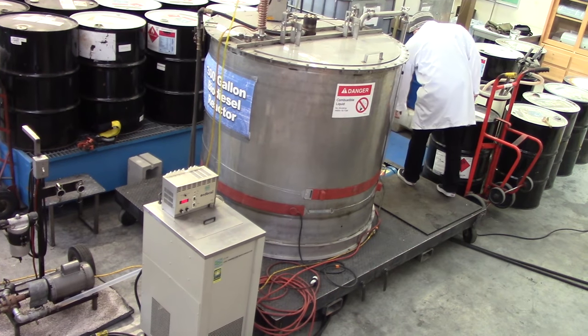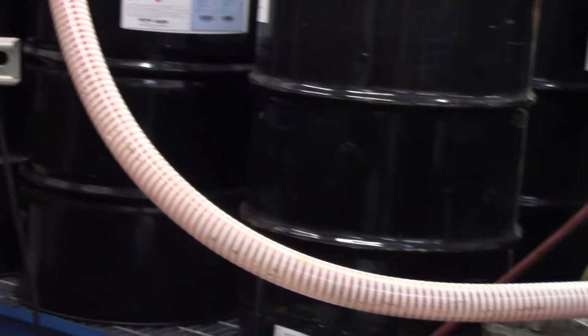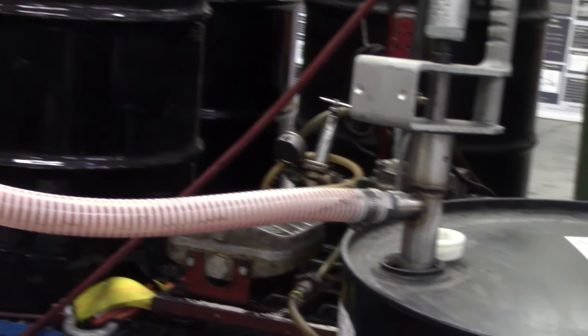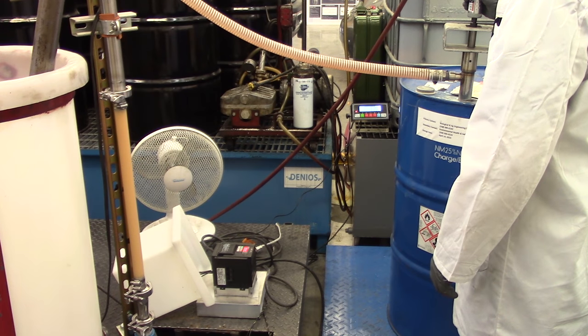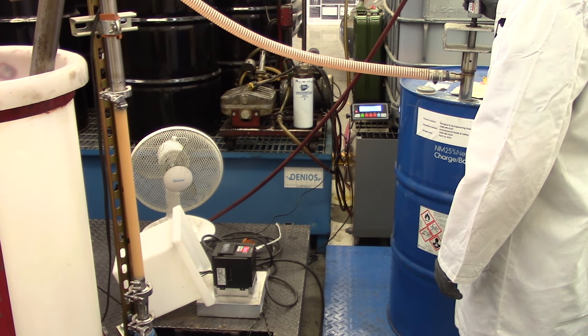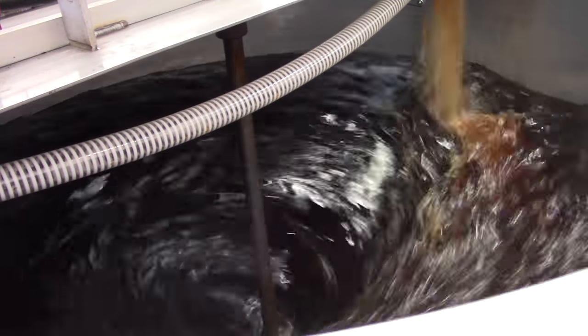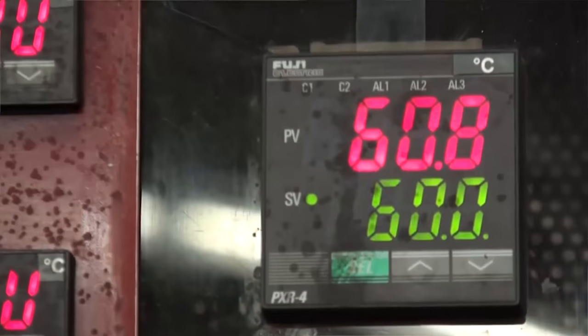With suitable feedstock in the reactor, the reactor lid is closed and we carefully add 80% of the methanol, which is extremely toxic and highly flammable, then 80% of the sodium methoxide, which is the catalyst we use for bulk production. The reaction mixture is then mixed vigorously for at least one hour at 55 to 60 degrees centigrade.